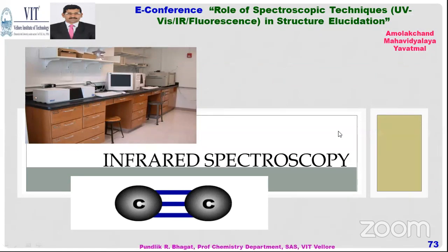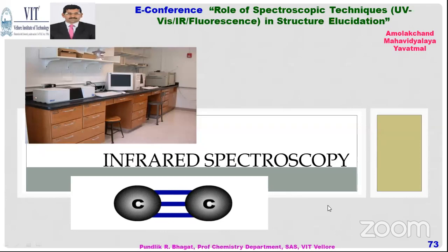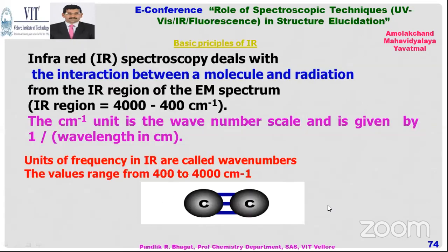As I mentioned in the previous slides, infrared spectroscopy uses IR radiations. It will not break the bond, but it will help to increase the stretching and bending forces. On the earth, when sunlight is received on the earth's surface, these IR radiations help to heat the earth's surface. That is what happens after interacting with the molecule.